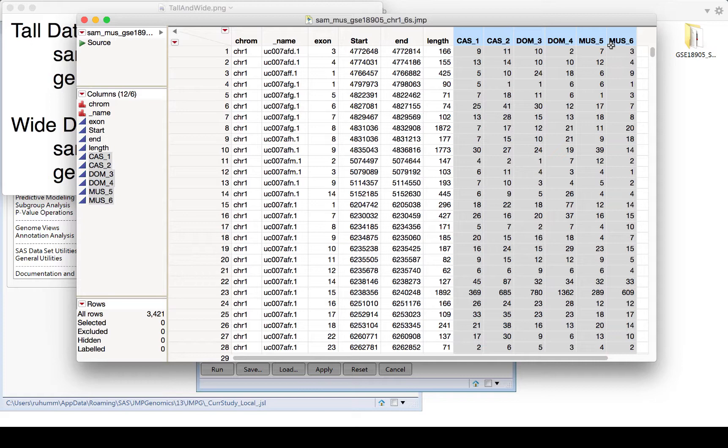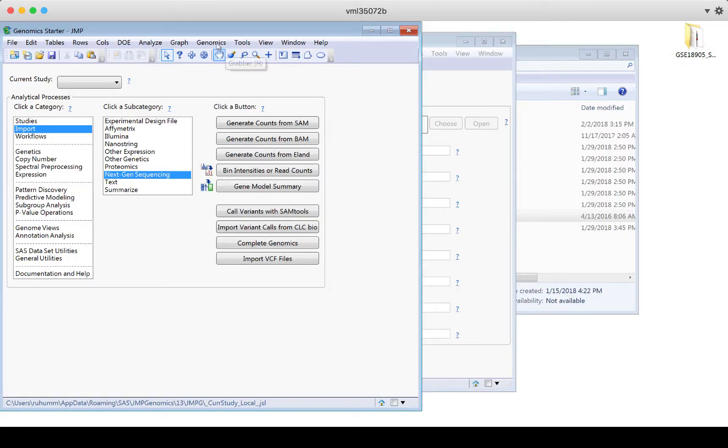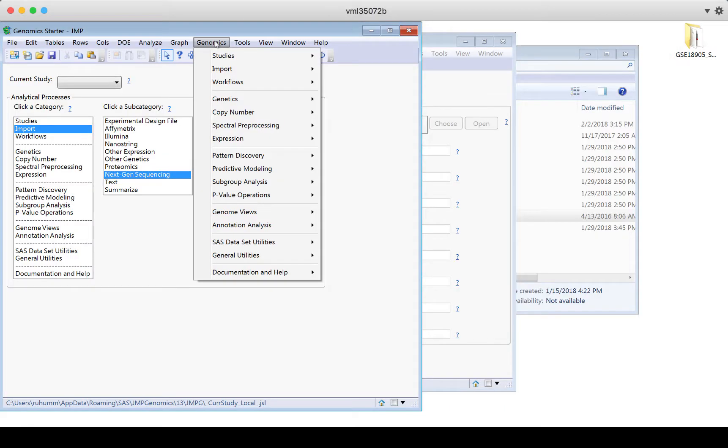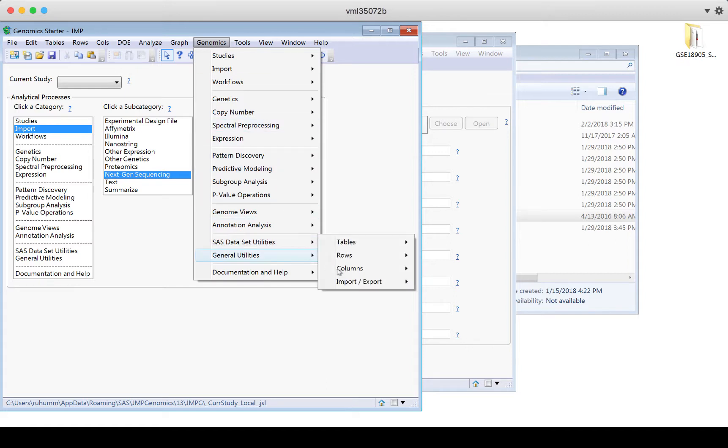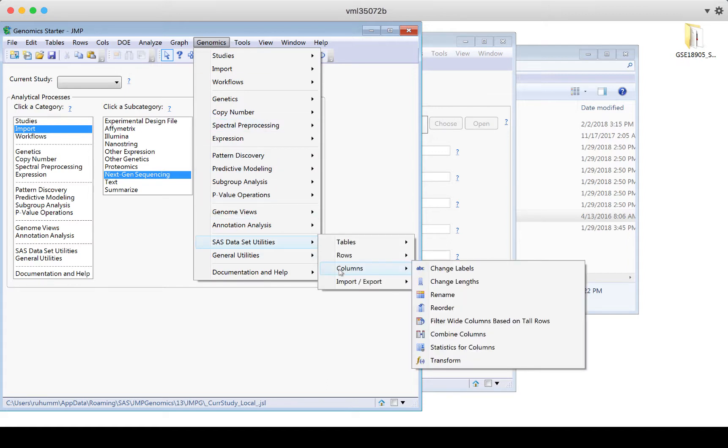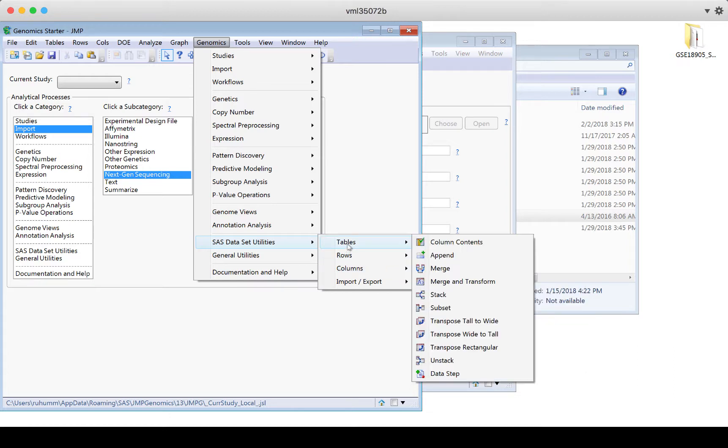If you need to switch between the two types, there's actually a button in JMP Genomics that will do this for you. You go to the Genomics tab, then to SAS Dataset Utilities, Tables, and here's transpose tall to wide or wide to tall. So there are lots of these utilities built in to make this as simple as possible for you.